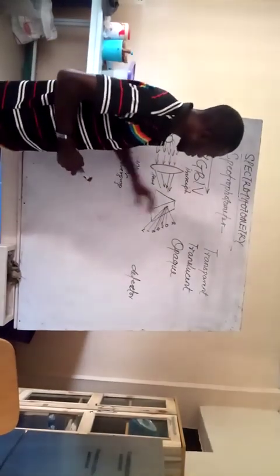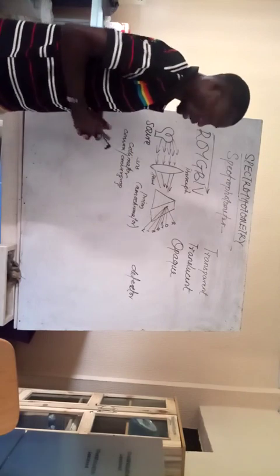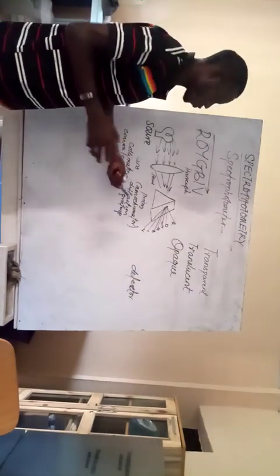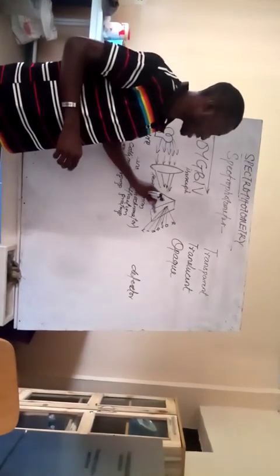Basically, the prism is called a monochromator. You also hear people call it the diffraction grating. The diffraction grating also works like a prism and it's rotatable. It is going to reflect the different wavelengths of light, and it is made to be rotatable so that it can be rotated to select a particular wavelength of light.